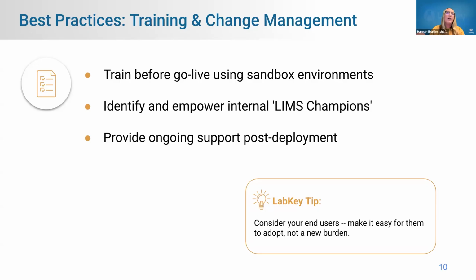And then the last one here is making sure that you have that ongoing support after the implementation. There's nothing worse than having this big, showy launch and then a drop off in support. And so when you're evaluating LIMS vendors or when you're talking to your LIMS vendor, ensuring that they have a plan for that support post implementation as well.